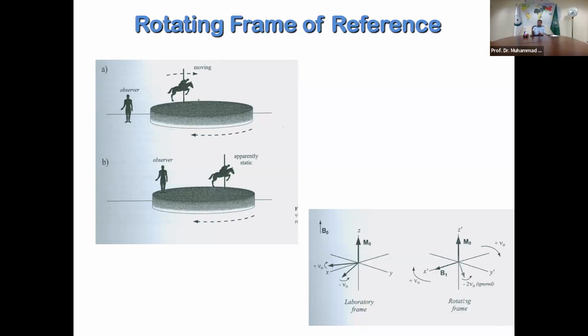But the majority of NMR experiments are not as simple. For that, you need to understand not only where the vectors will go when you give a radio frequency pulse, but also that after some time they will split, and their position on the XY plane will be understood only with the concept of the rotating frame of reference.